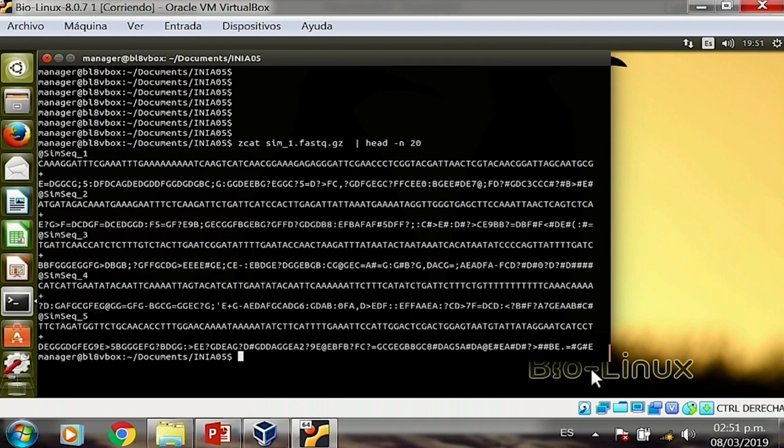If you start making the correlation, you'll see that it's not the 0 that really matters, it's the number to the left of the 0. If it has a 40, then it has 1 divided by 10 to the 4th, which is 1 in 10,000. If it has 50, it is 1 divided by 10 to the 5th, 1 in 100,000, and so it goes. So basically, that's what's being encoded here.